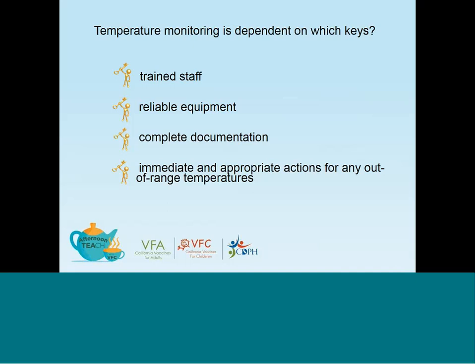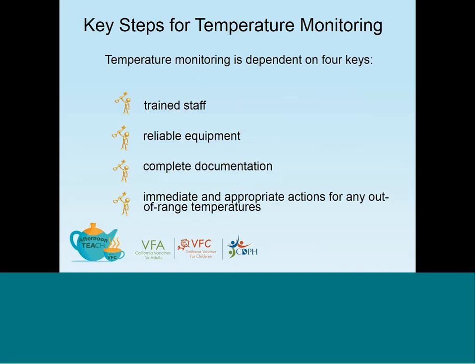Okay, the poll is now closed. It looks like overwhelmingly everyone agreed that actually all of these are key steps for temperature monitoring. Making sure you have trained staff, reliable equipment, making sure you complete the documentation, especially in ink, and respond immediately and take appropriate actions for any out-of-range temperatures.